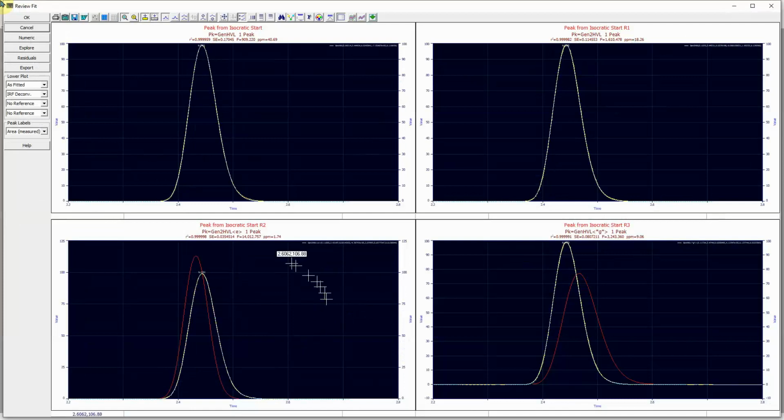The model with the IRF has the same fit that we saw in the model discovery, a 1.74 part per million error. The red is the deconvolution of the white peak, which is the observed, showing the difference between the peak with and without the instrument response distortions. And you can see the IRF is still quite significant when you're fitting in this manner.